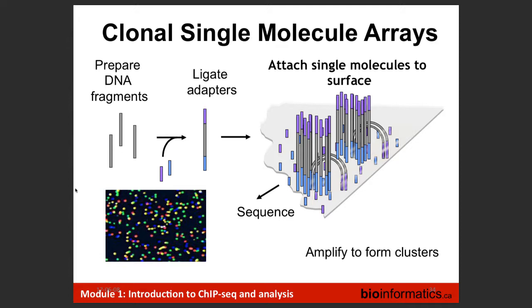inside some subset of the number of microreactors, which means we have to use a lot more volume, which is one of the reasons why these types of technologies have not really caught on to the degree that, for example, Illumina has, where we've got the solid state surface.